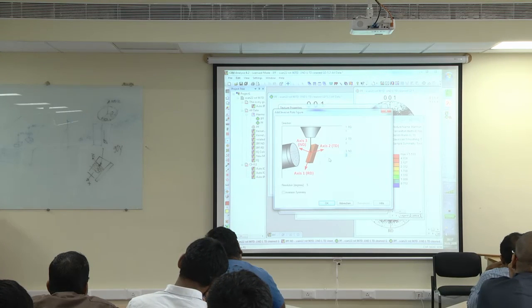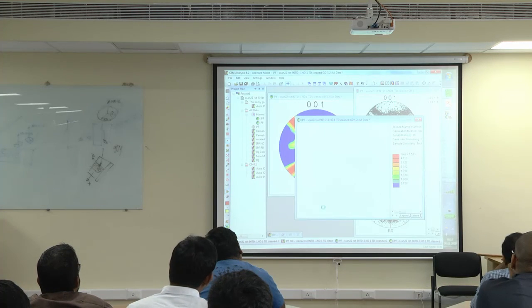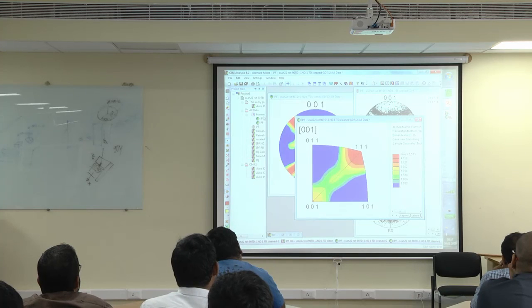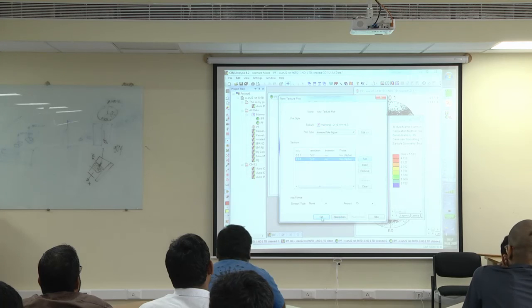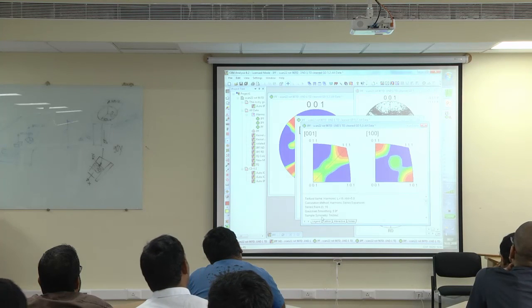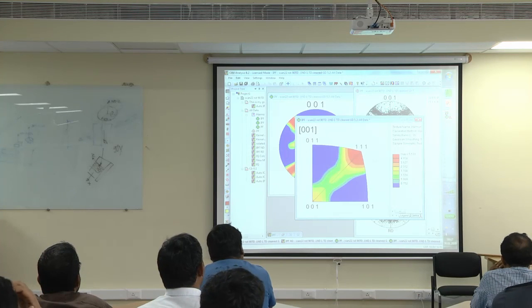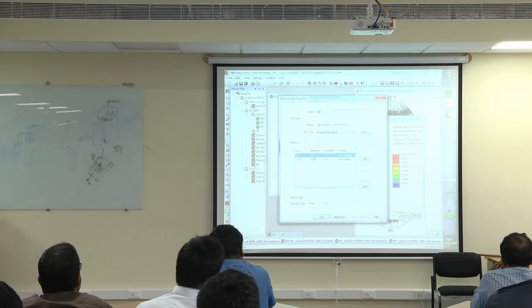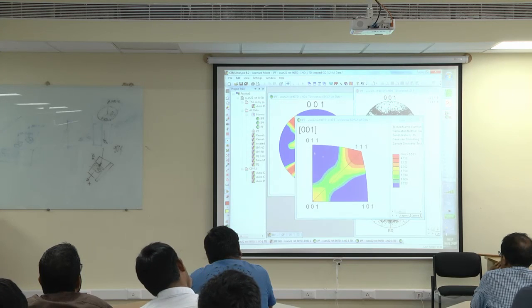Okay, this is very quick. We don't need to wait for that long. There it is already. And we can now plot it. Inverse pole figure. This one here. Oh, it puts it together. So I didn't want to. Oh yeah, well, now I deleted it. Stupid. This one here. Remove. Okay. Calculate.